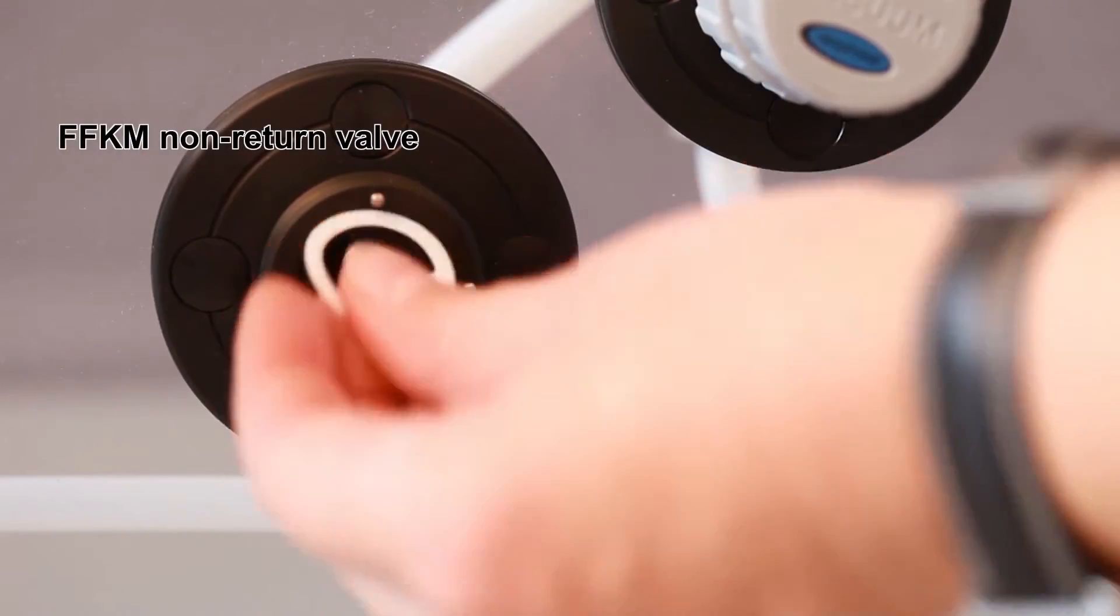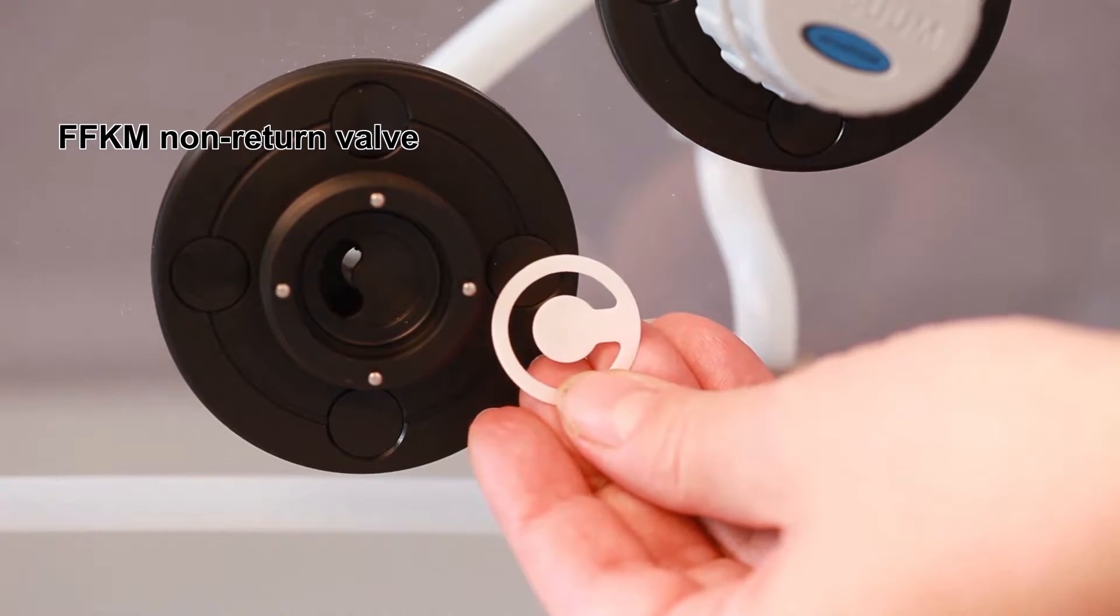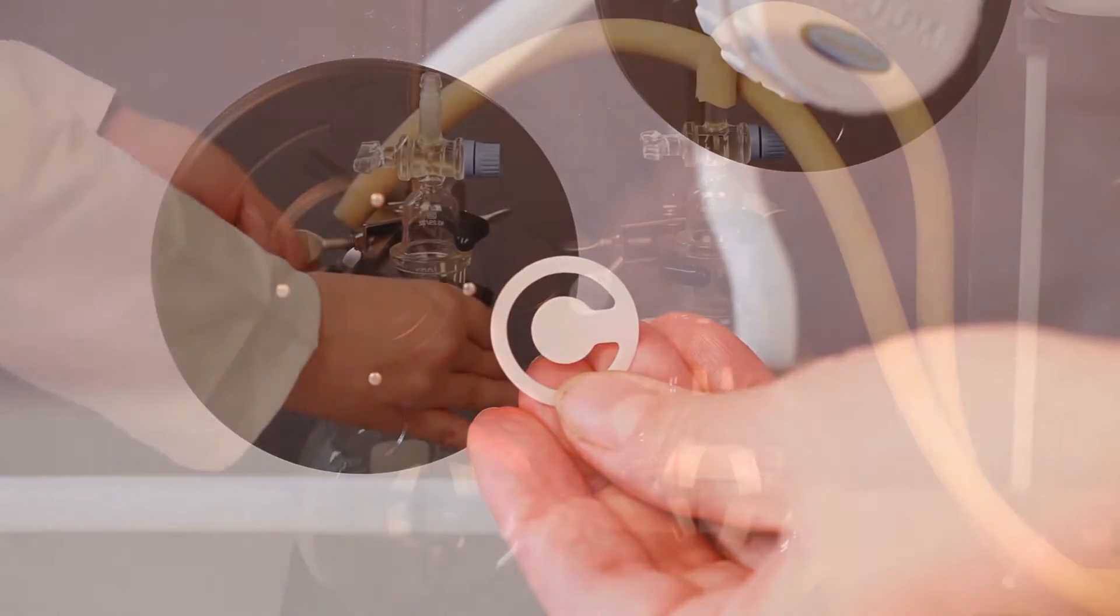For comparison, we use the same test setup but this time with PTFE tubing and VacuLand ports with check valves.